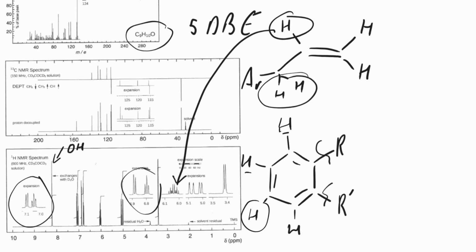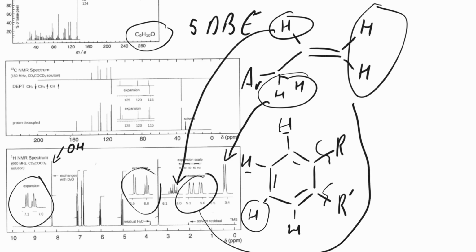Because these 2 protons are an alkane, not an alkene, we'd expect them to be the least shifted. So they should be the doublet down here at 3.4. Finally, we have these 2 protons. These are the peaks at 5.0 and 5.1. Because there is no rotation around that double bond, those 2 protons are actually in slightly different environments, which is why we see them as different peaks. So we can't say exactly which is which without doing additional analysis, but we know that these are these.